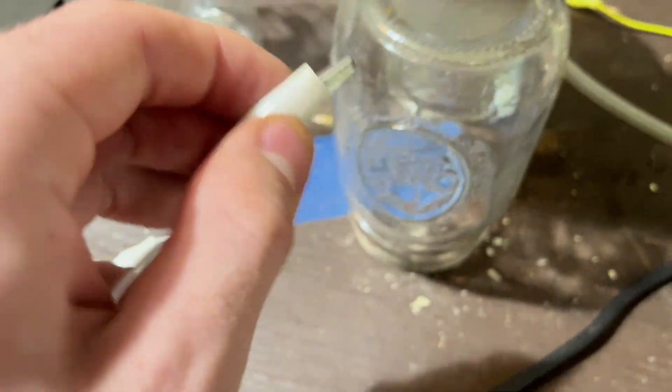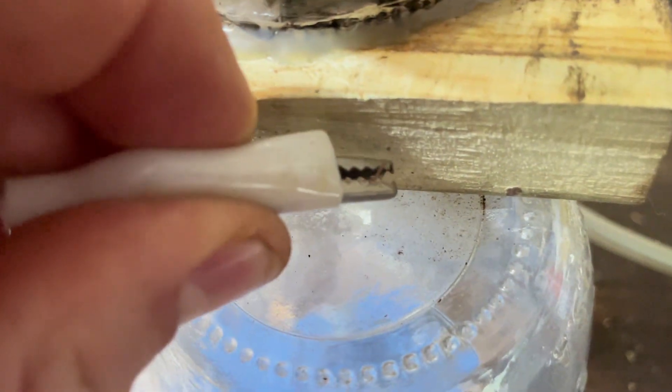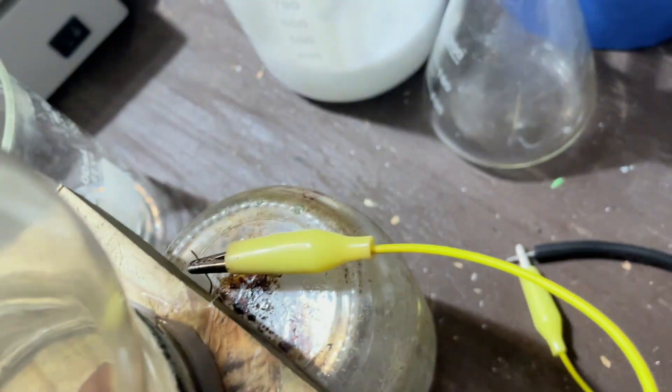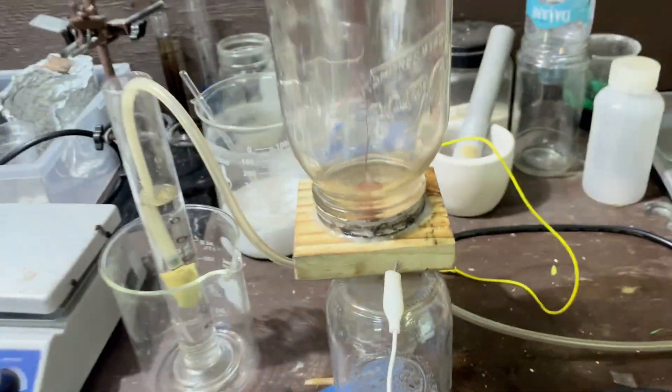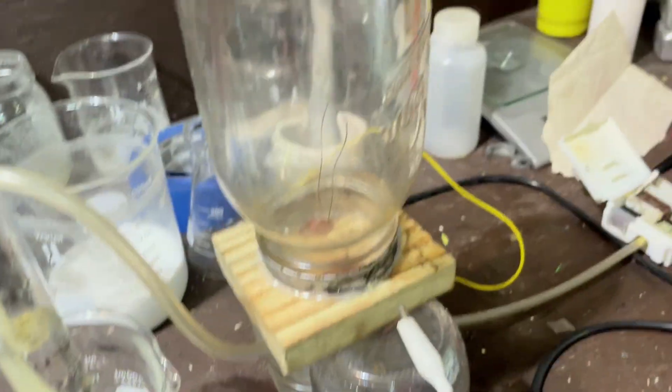Going to some alligator clips. Now I just need to put these guys on my wires. All right, that one's all set. Now that everything's put together, I should be able to just turn it on. I think we're going to just do that for now, just to take a look at how it behaves.